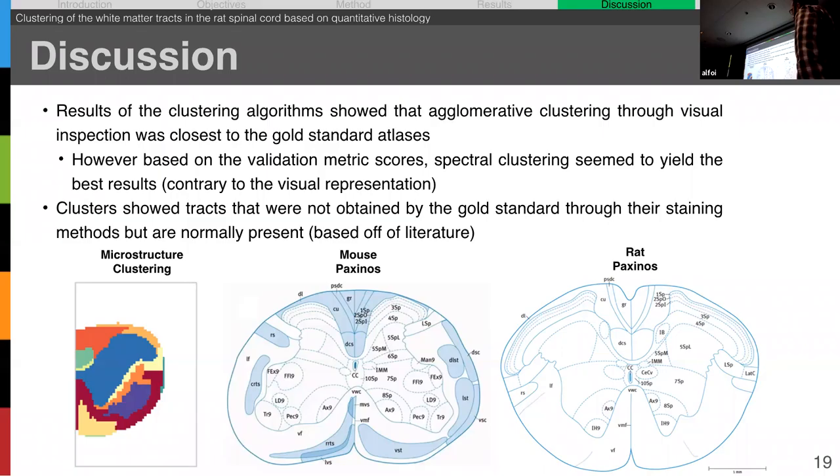Yeah, exactly. For the gray matter, I only looked at it a bit when I was writing my thesis to talk about the tracts, but it is divided into a lot more variation of tracts. It should also be symmetric from my understanding, or mostly symmetric. You'll see some differences in circles, but it's essentially divided in the same way on both sides. You see the same tracts, like TR9 here, TR9 here. It's the same divisions, right? Here, the IMM is just not found on this side, but for the most part it's divided symmetrically.